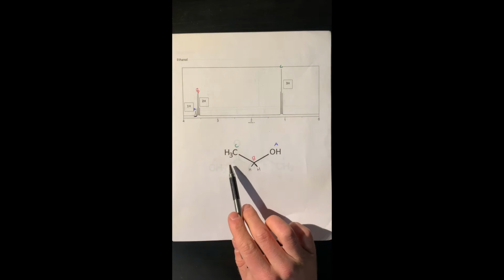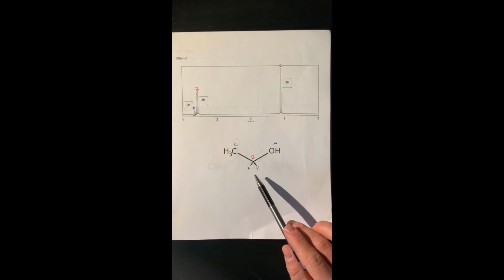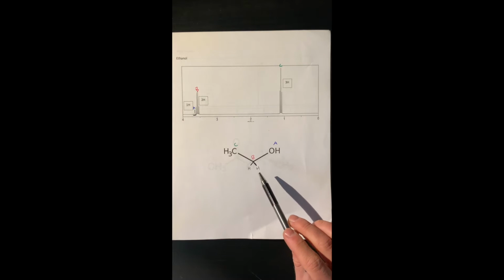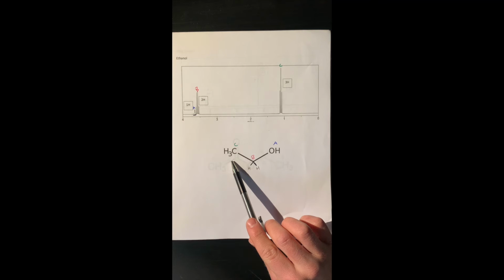And so I have put a photo of the structure of ethanol down here. As you can see, the structure is CH3, CH2, and an alcohol. The hydrogen on the alcohol will appear as a singlet, because there are no splitting patterns here. The two hydrogens in the middle, the CH2, are chemically equivalent because they are connected to the same carbon, and they're adjacent to the CH3 carbon, which will have 3 hydrogens, obviously.